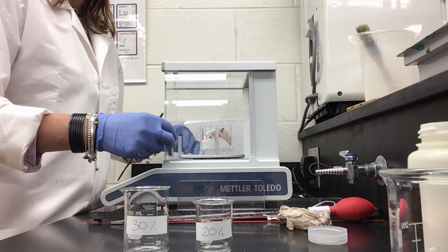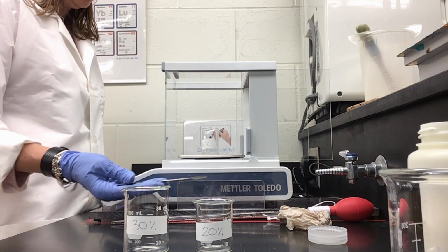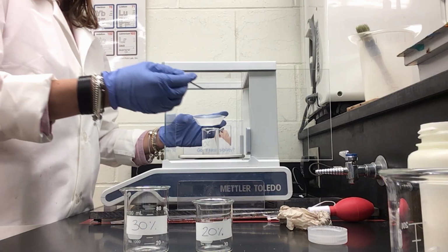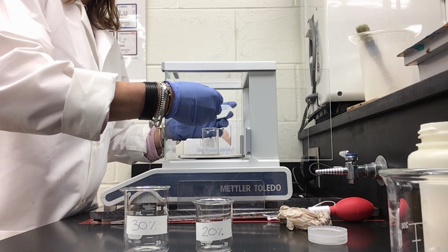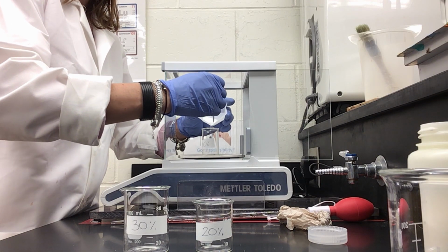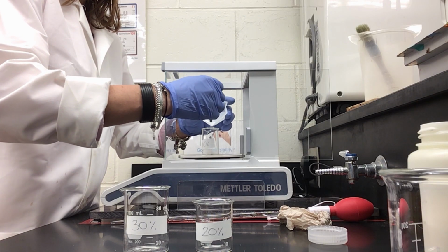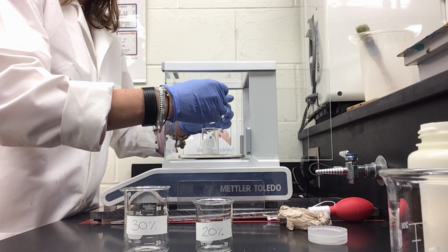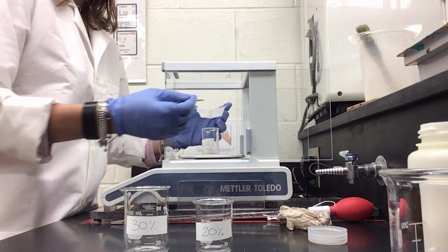So at this point, I am gonna open the 2 side doors. So my right hand will be here and my left hand will be here with the weigh boat, okay? So I go inside and I put some of the sugar inside. For the 10% solution, I needed 3.5 grams. So I can just drop it, drop it, drop it. When I approach the 3.5, I'm gonna go very slow. So slower, slower. There we go.